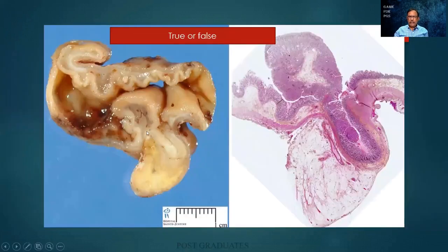And this is what I had been talking about. In this case, there is a diverticulum that is going over here. And here I am able to see the muscular layer as well as the mucosa and the submucosa. So this is a case of a true diverticulum where all the layers are present. But sometimes there is an absence of the musculature, and we can call it a false diverticulum. True diverticulum, false diverticulum. One of the commonest complications is peptic ulcer.